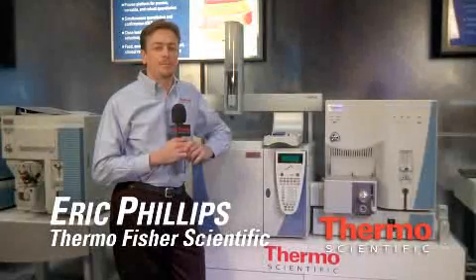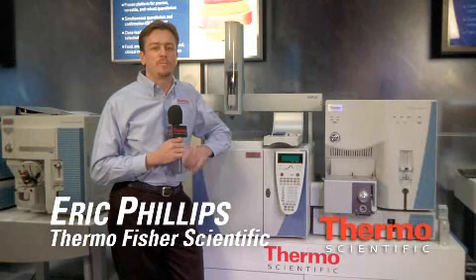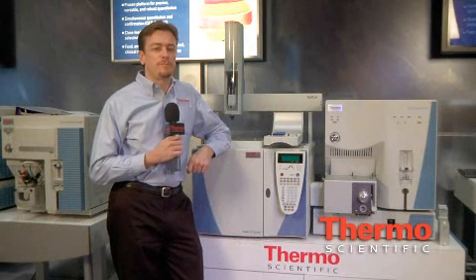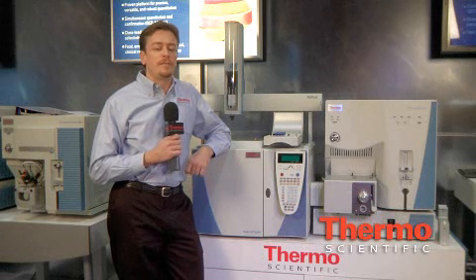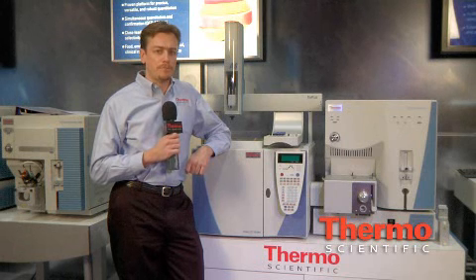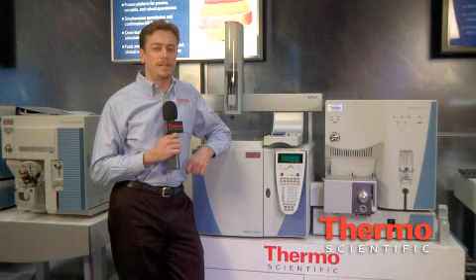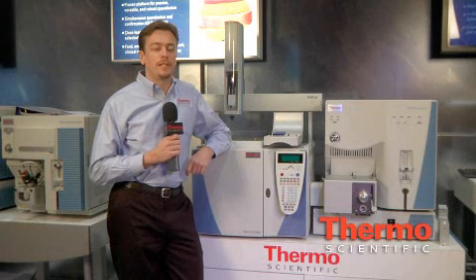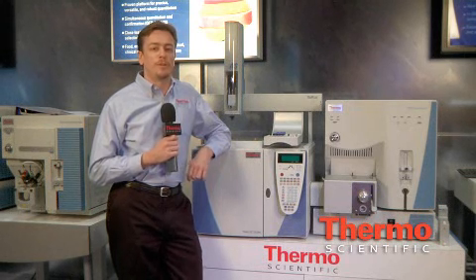Hi, my name is Eric, and today we'll be talking about the GC and GCMS product lines from Thermo Fisher Scientific. It's a complete set of product lines, including mass spectrometers and gas chromatographs. The flexibility and functionality of these instruments allows them to meet the requirements of the laboratory and allows for capital investment protection over a long period of time.